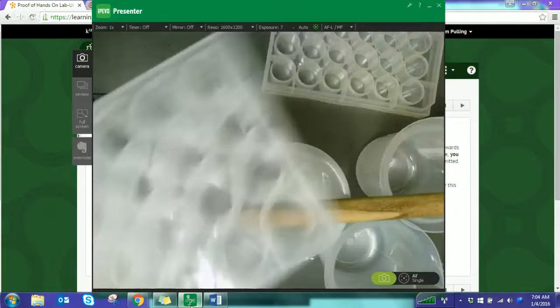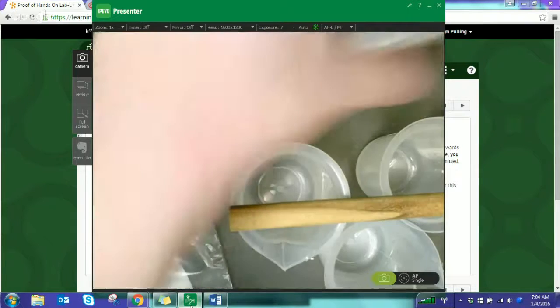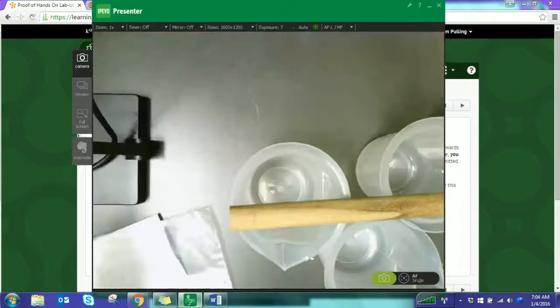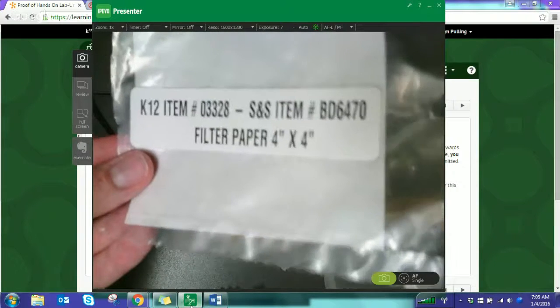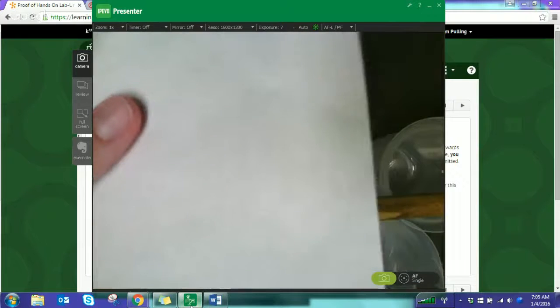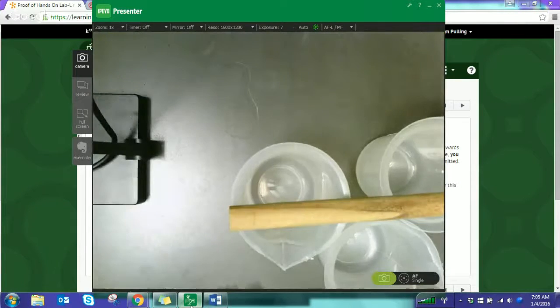Go ahead and take them out of the plastic that they're in. If they are at all dirty, clean them. One of mine definitely looked brand new, but the other one had probably some leftover chemicals from the last person who used it, so wash those out. There are 2 pieces of filter paper in plastic. You're going to want to take those out of the plastic so you have them ready, and I'll talk you through cutting those down later.